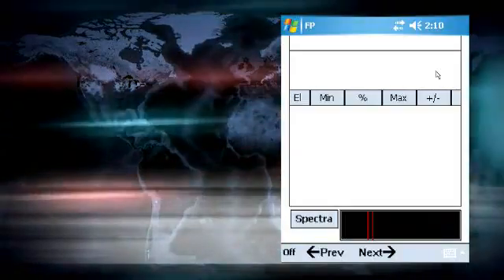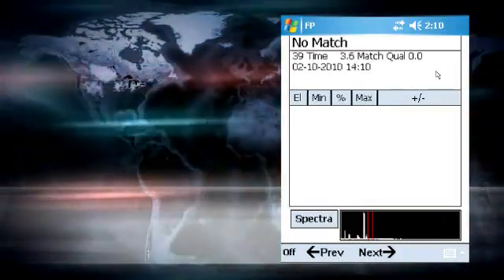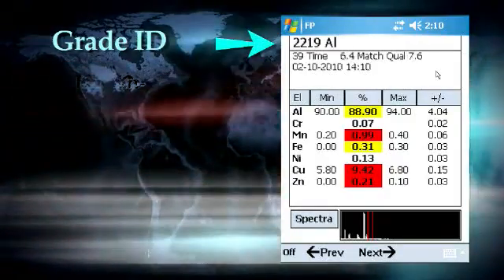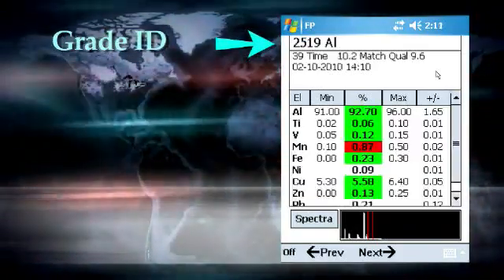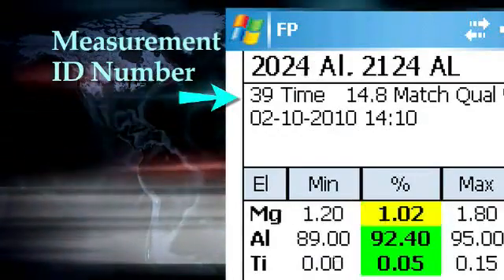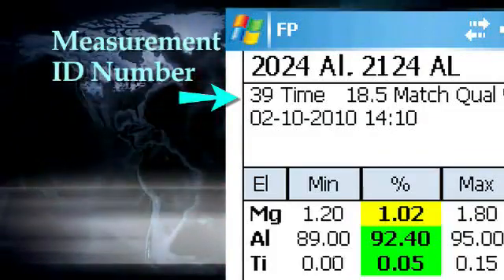When the trigger is pulled, x-rays are activated. This should quickly result in the display of a set of data on the PDA screen. This display will include the grade identification on the first line. If there are several grades which are very similar, there may be up to three grades identified on this line. Below the grade is the measurement ID number. This number will be saved with the data and in the results file, and becomes the internal identification of the sample.